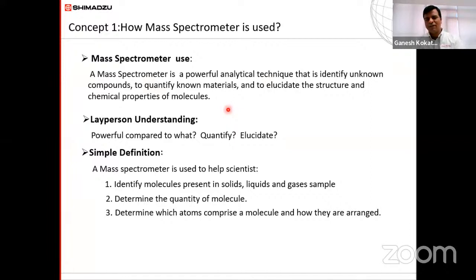If I'm going to purify a molecule, for example, I have one API with me, I need to purify that API, and the concentration of the API, if you are calculating by area percent, may be 80%. So I need to find out what the remaining 20% is all about. Either it's an inorganic component, or it's some impurities present in the sample, which I need to identify.